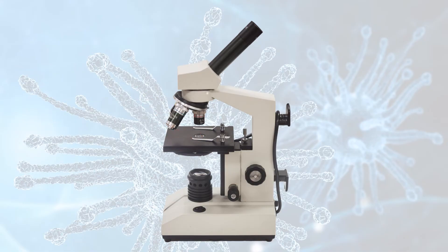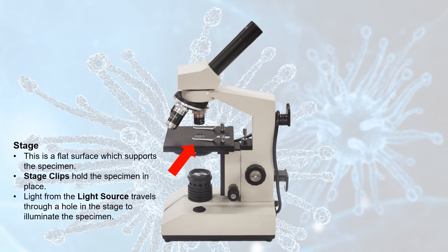The stage, which is the part of the microscope right here, is a flat surface which supports the specimen that you're looking at. On top of the stage, you have two stage clips, one on each side of the stage. You can see them here. These are used to hold the slide with your specimen in place while you're viewing it. There is also a hole in the center of the stage right here. This allows light from the light source to travel up through the stage to light up or illuminate the specimen.